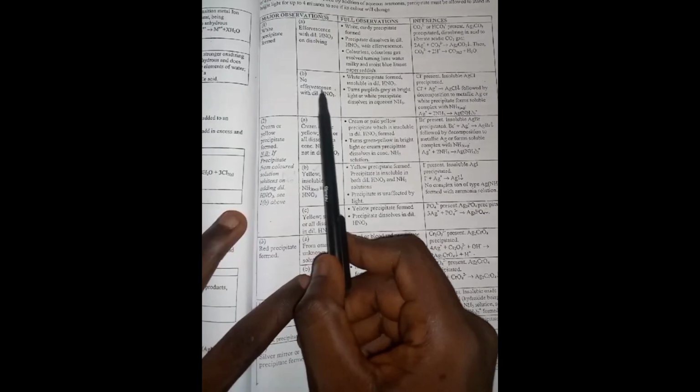Okay, no effervescence will be evolved. So I have no effervescence involved with dilute nitric acid. Good. I have a white precipitate formed, right? Insoluble in dilute nitric acid. Perfect. This is what I'm talking about, right? It turns purple gray in bright light.